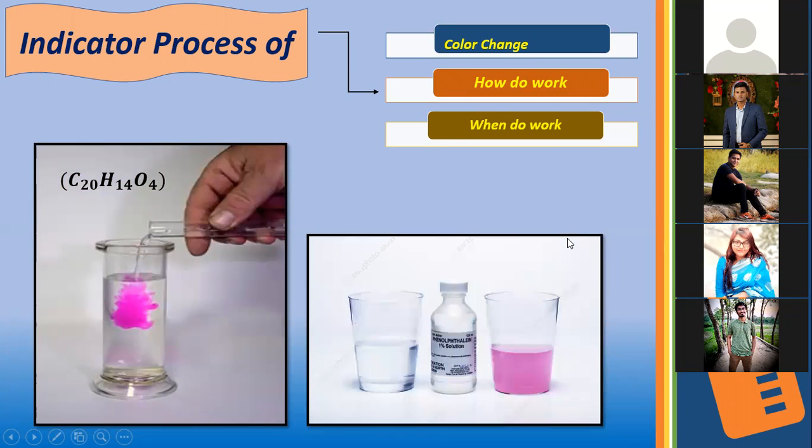In this acid-base reaction, we use phenolphthalein indicator and its pH range is 8.2 to 9.8. In this reaction, we combine the indicator with sodium hydroxide, which shows color, and as the titration goes on, at last the color becomes colorless. And at that time, the pH is below the 8.2 to 9.8 range. This is how the indicator works.